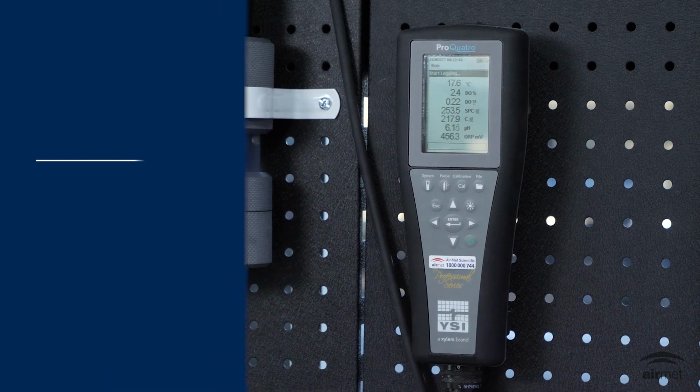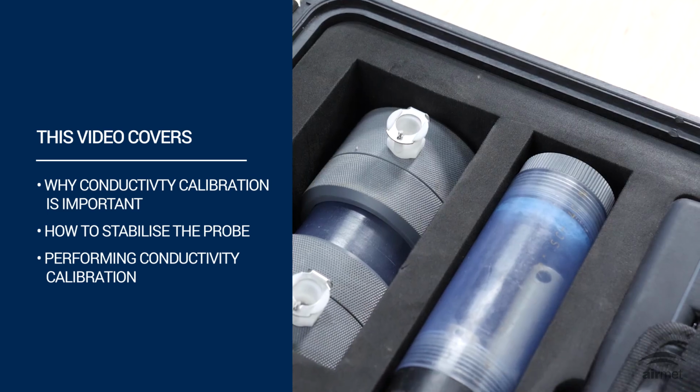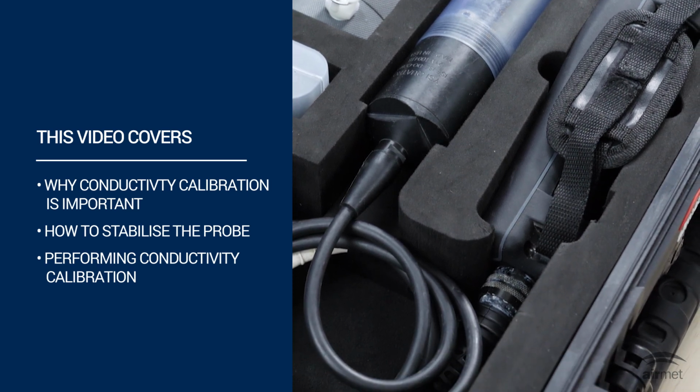In this session, we'll explore why conductivity calibration is important and how it ensures accurate salinity and TDS readings. We'll go through the steps to show you how to stabilize the probe, enter the correct value, and complete the calibration so that your measurements in the field stay reliable.